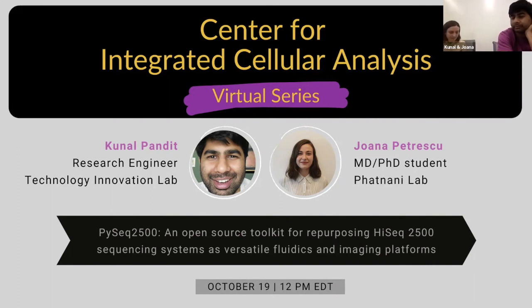Yeah. Nice. And then the other thing I was wondering is, in the protocols, I read that the imaging protocol can take up to 6 days or something like that, like 4 or 5 days. Do you see a decrease in the quality of the tissue itself? And would you recommend people start cycles with those antibodies that have worse signal and then end up with those that have better signal?